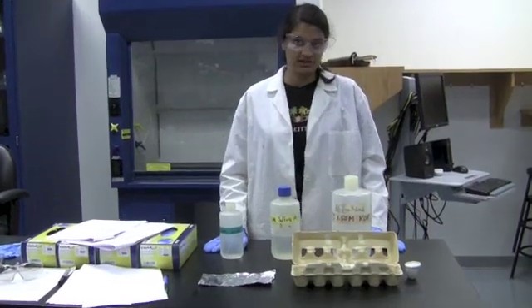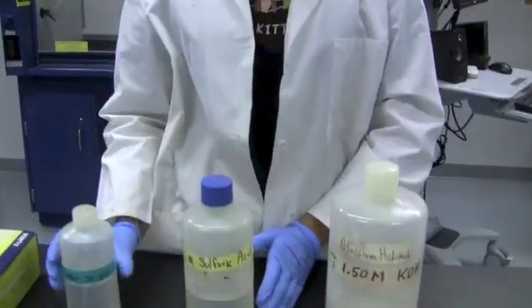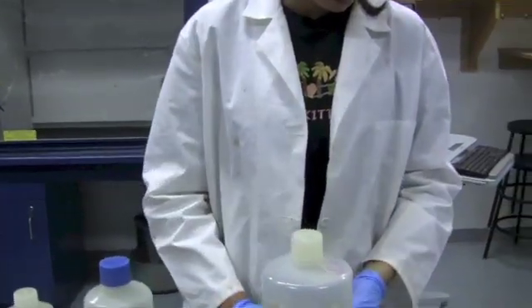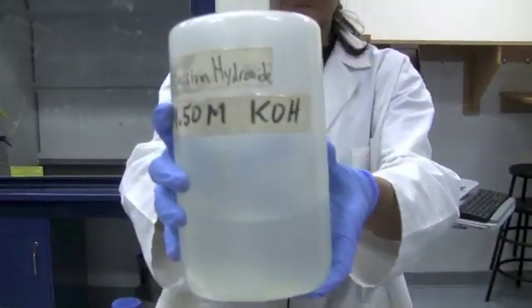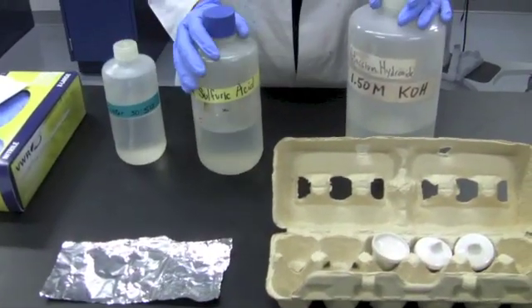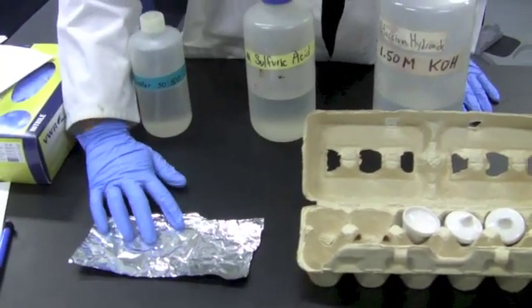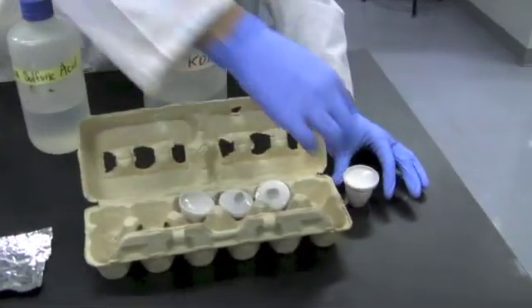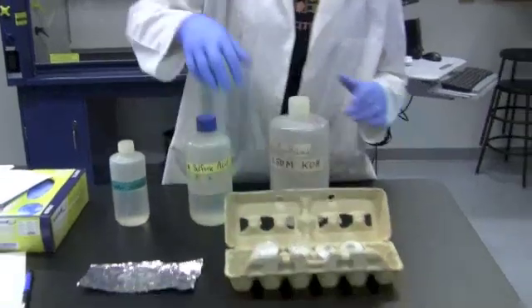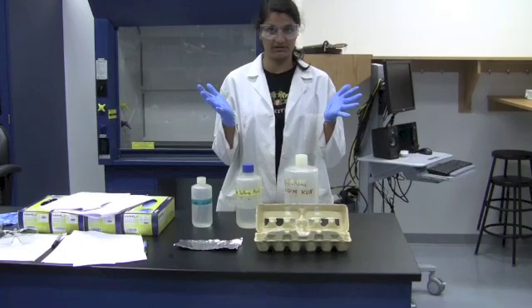In week one, the materials that you're going to be using are a 50-50 water and alcohol solution. You're also going to be using 3 molar sulfuric acid, 1.5 molar potassium hydroxide. And just remember that all of these need to be recorded in your lab notebooks, because these molarities are going to be very important for your data and your calculations. You're going to also be using aluminum foil, and at the end of the day, you're going to be weighing out this crucible. Now remember, because you're handling 3 molar sulfuric acid and 1.5 molar potassium hydroxide, that you should be wearing rubber gloves, and also wear your lab goggles and clothes or shoes.